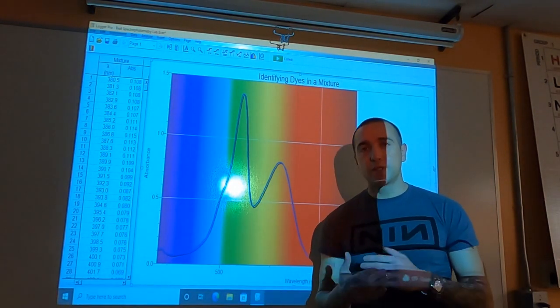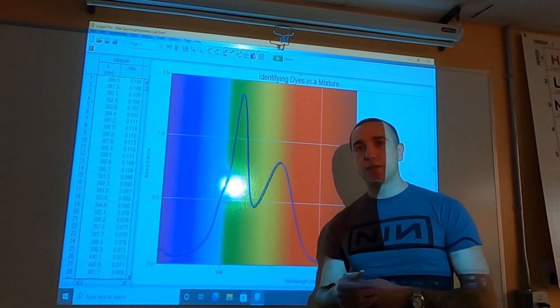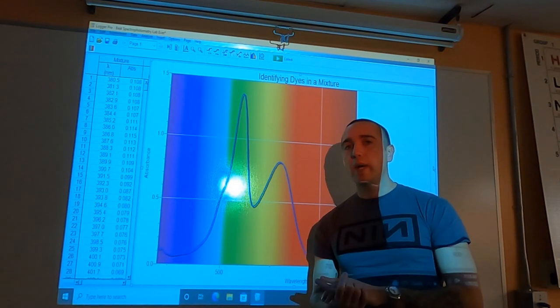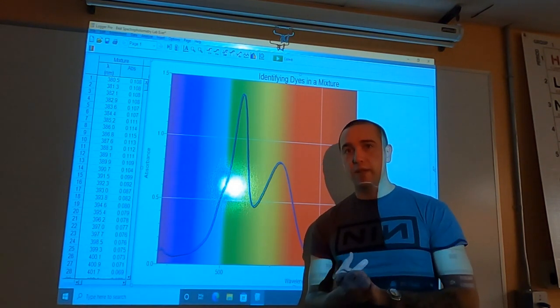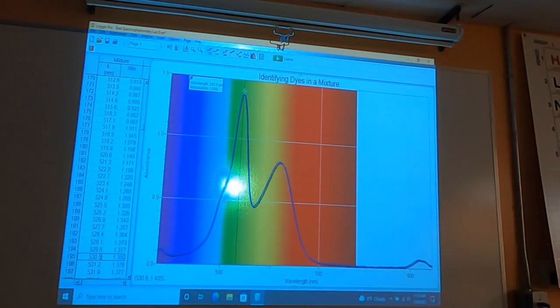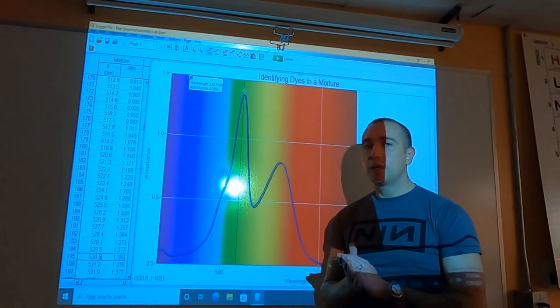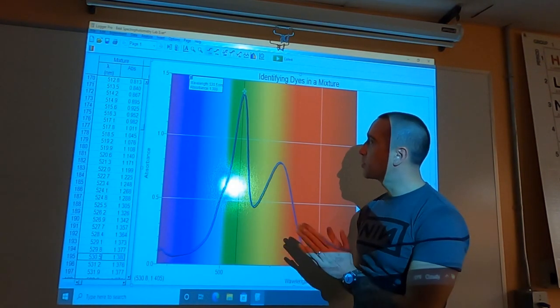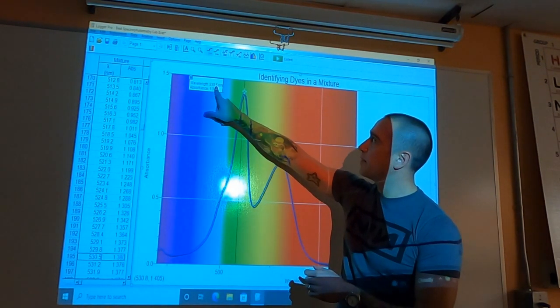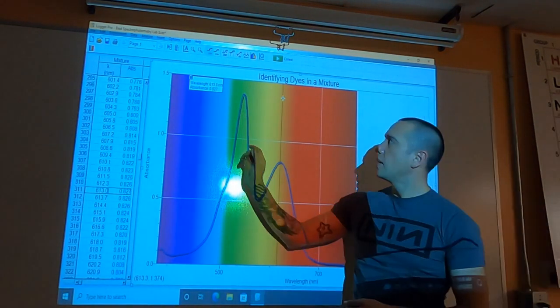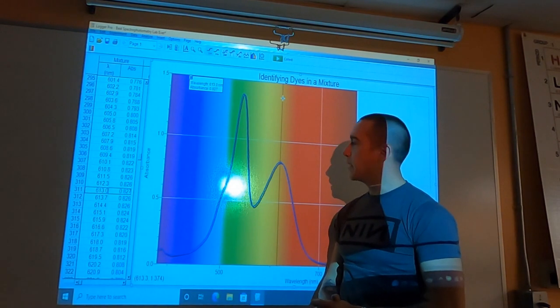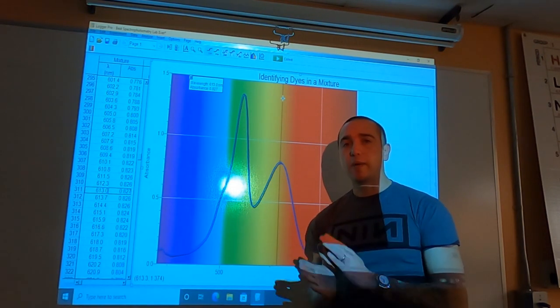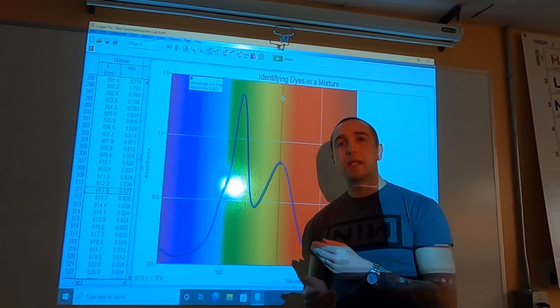And here we go. This is just the mixture. And so what you want to do, in addition to having this graph saved to include in a write-up, is you want to hover over and figure out where the peaks are, what wavelengths the peaks appear for this. So using the examine function, you can hover over where the peaks are and it will tell you a wavelength. So I know that the peaks for this mixture occur at a wavelength of 530.5 nanometers and a wavelength of 613.0 nanometers. So what I'm looking for are two different dyes that would account for those two peaks. One would have the first peak and one would have the second peak.